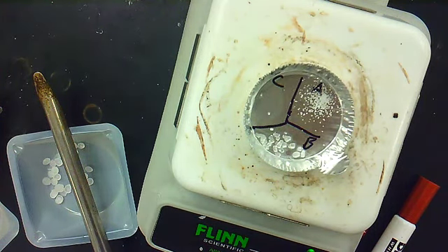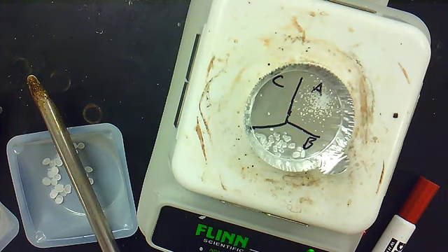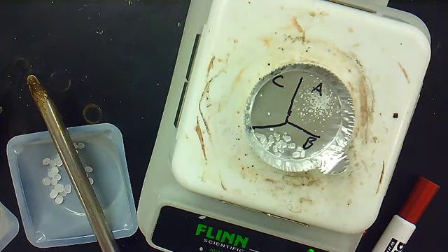Okay. Turn up the heat just a little bit to see what it does. Okay, so B is a little bit contaminated, but we should still be able to see the results here. A is now a little contaminated as well.